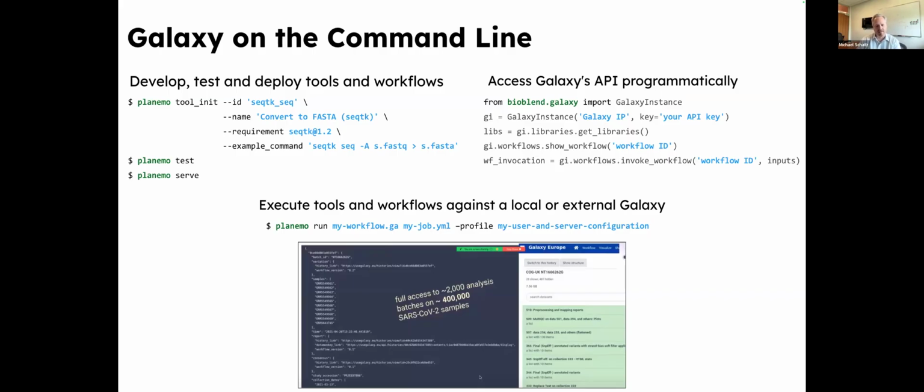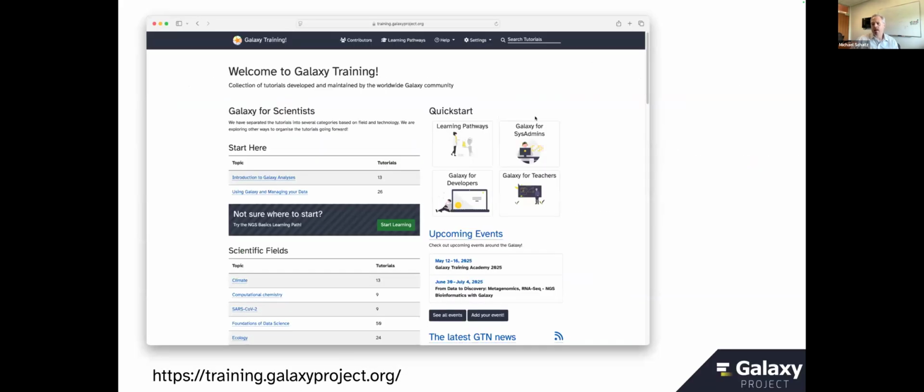It's a little bit more advanced. We're not going to go into that today, but I did want to just highlight it often starts in the browser, but if you outgrow what's available there, yes, you can do everything via the command line. You can do everything via APIs to scale it up in an automated way if that's what you need to do.